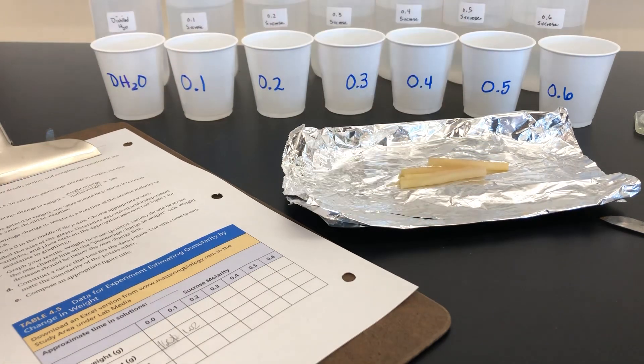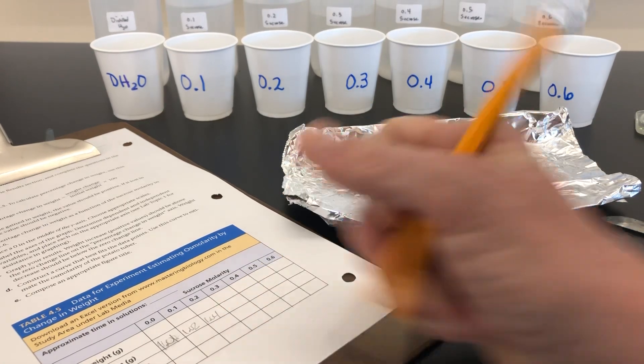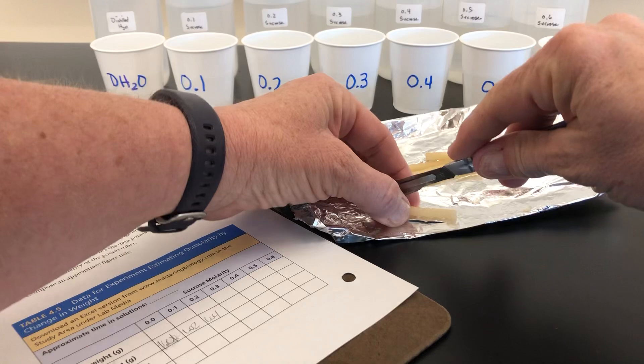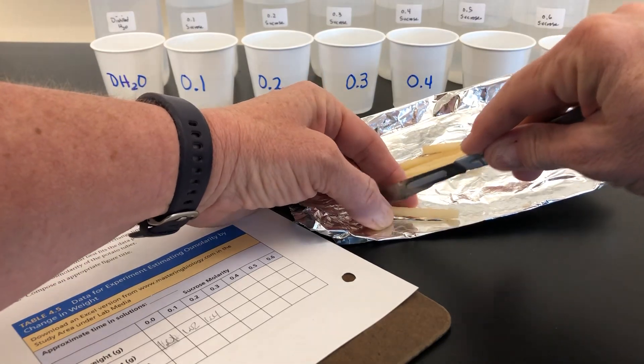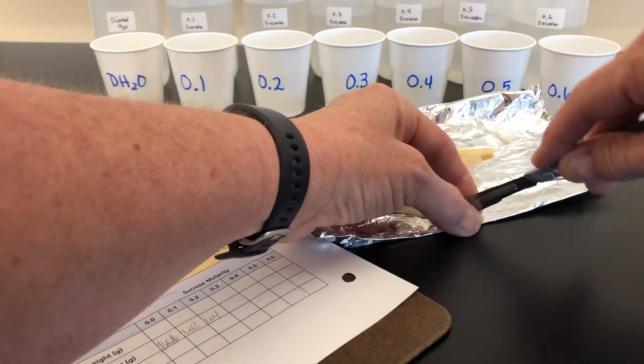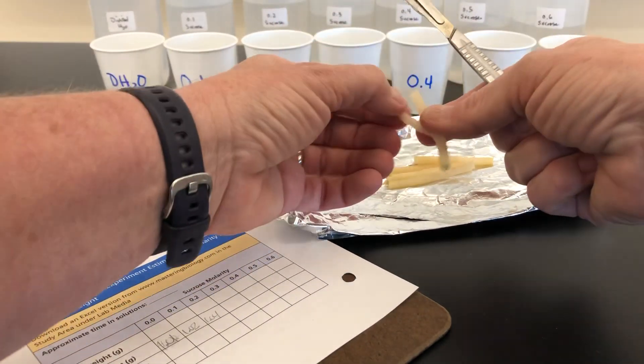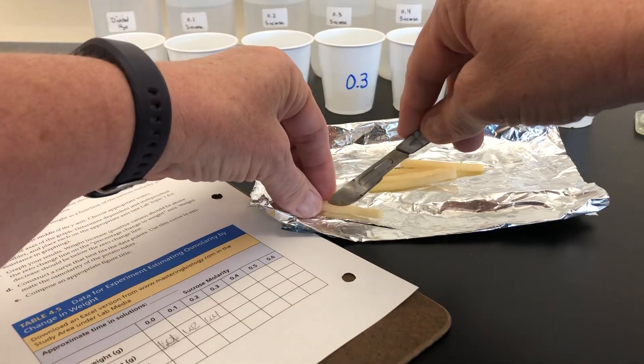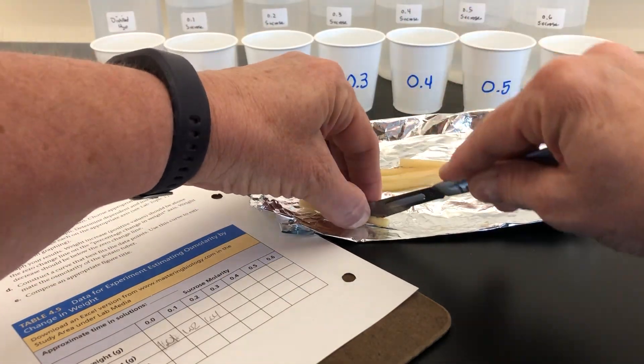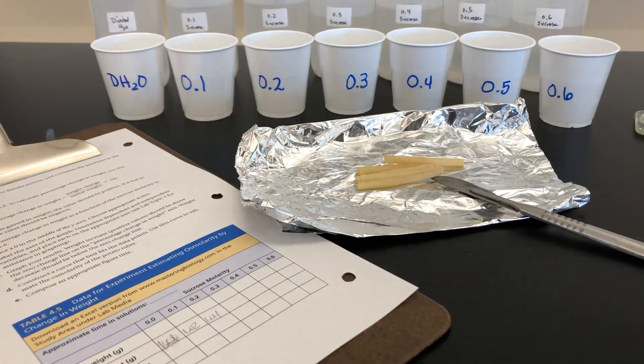Our second cylinder weighs 1.04. We'll place it in 0.2.